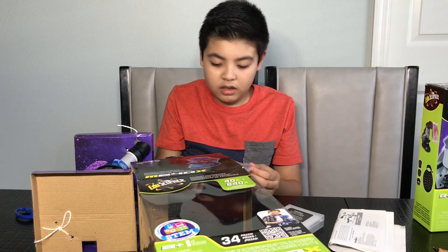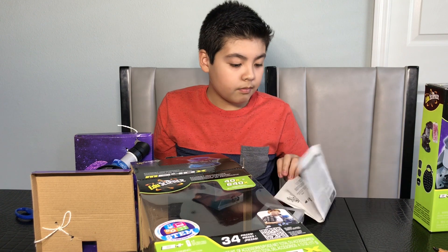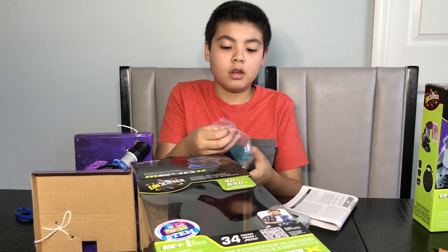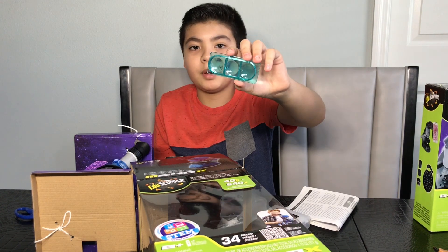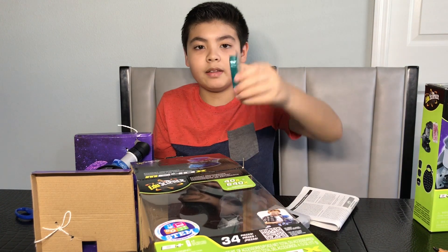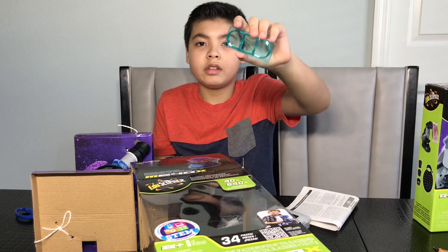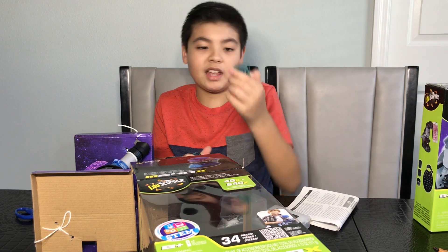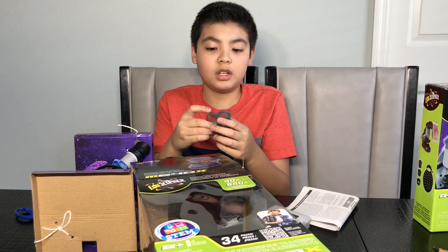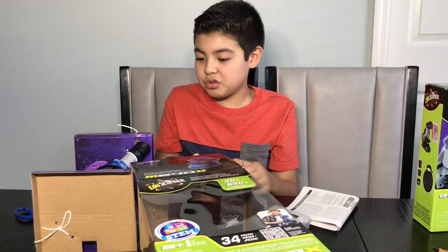What is this? This is the shrimp hatchery. I'll show you here. Look at the shrimp hatchery — I think this opens up. It does. So this is like where you hatch your wonderful shrimp. I guess they made it like this so you can divide your shrimp evenly. That's cool. You get to make your own — you get your shrimp eggs.